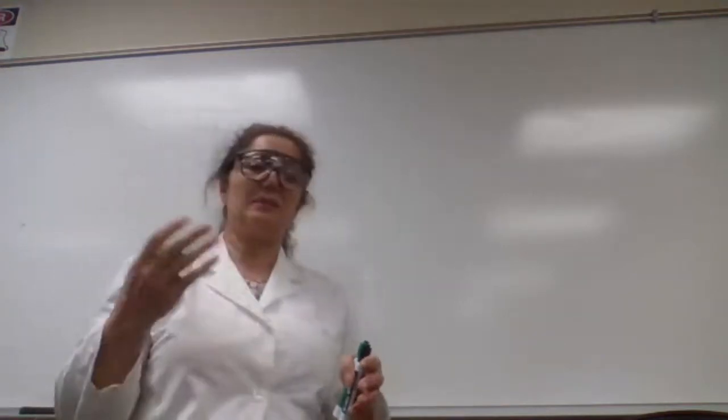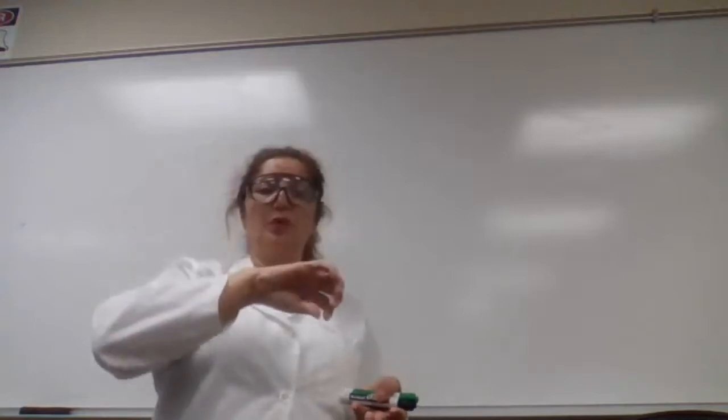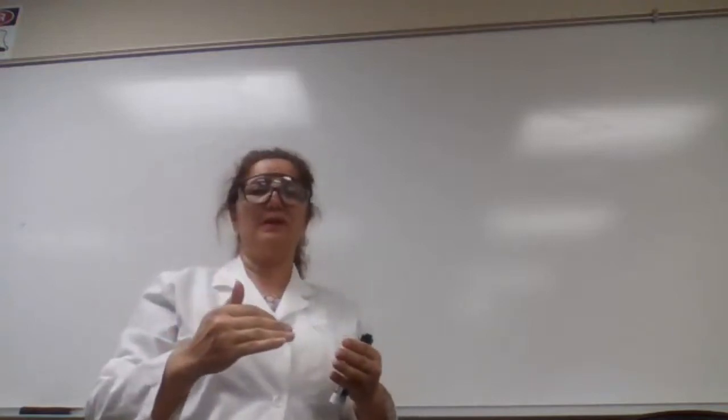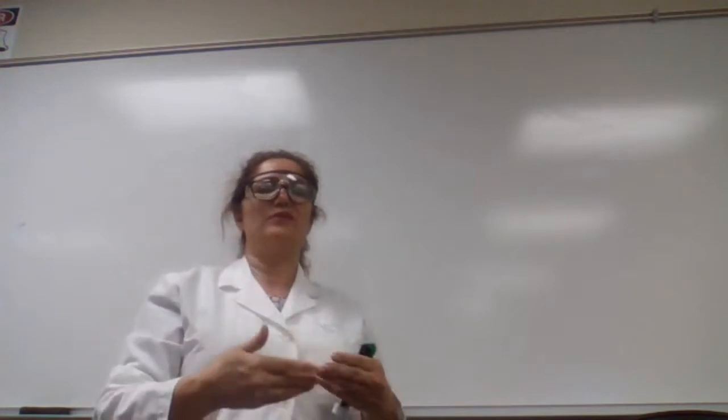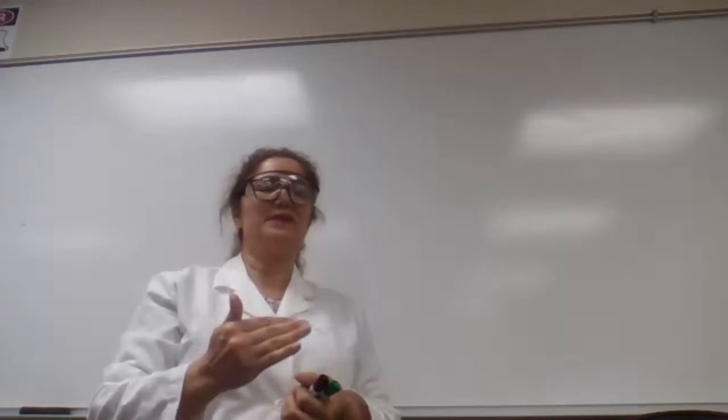The general procedure is this way. You are going to heat up the metal to a high temperature, and you drop it or pour it into cold water in the calorimeter. Why we have to use a calorimeter, I will explain that. I'm just going to go over the theory first.